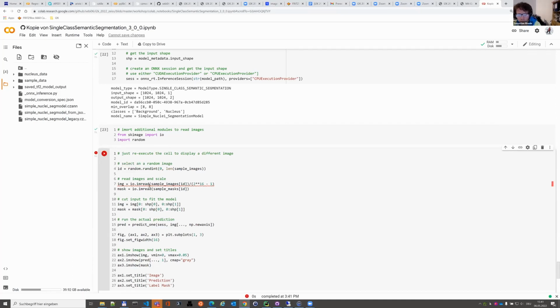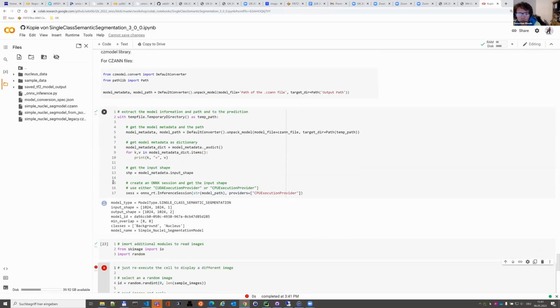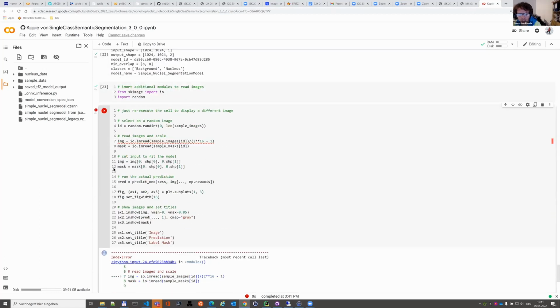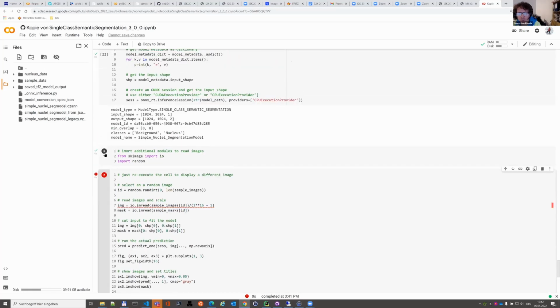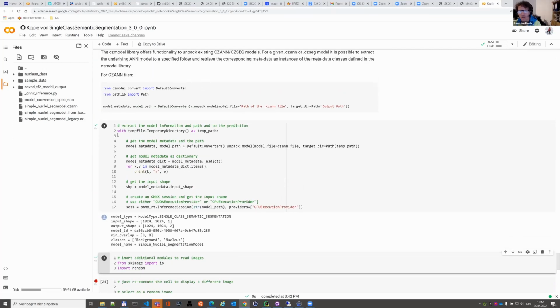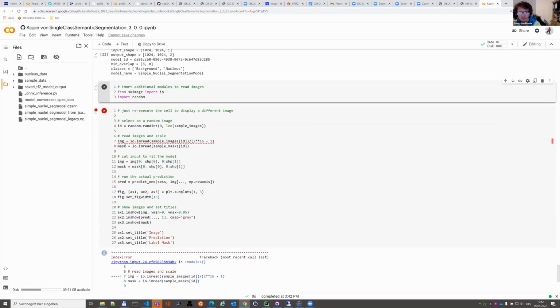Oops, no, what did I do? Did I forget to press something? It used to work. Shame on me. Index out of range. Sorry, I have to check. Okay, I hope you believe me. You can easily do the prediction and then plot it. It's, I think, just here.